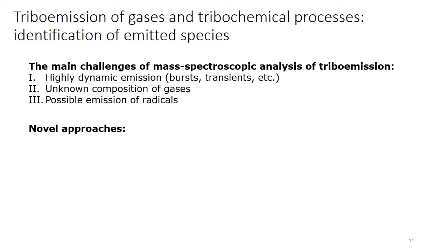So the beginning and the end of the same mass spectrum will not correspond to the same process. It should be analyzed very carefully, with much attention paid to the time resolution of the processes and to selecting appropriate time parameters of the mass spectrometer measurements.